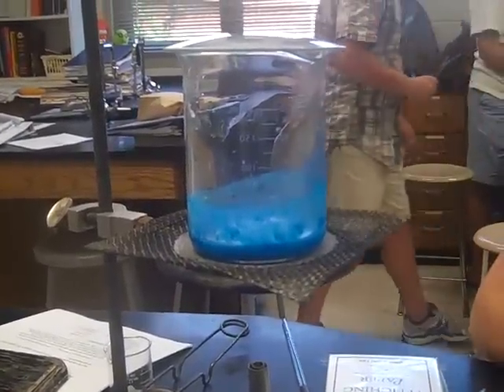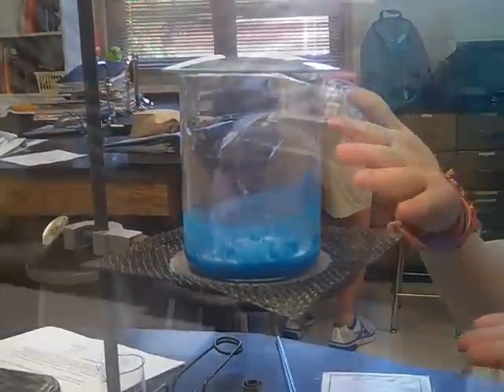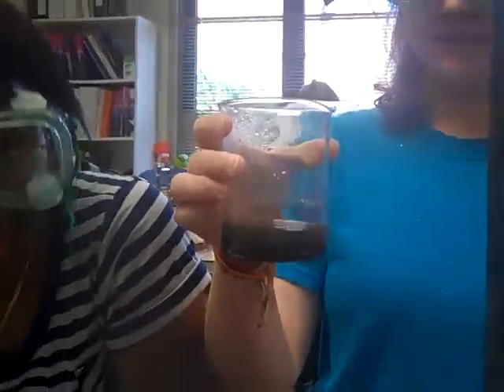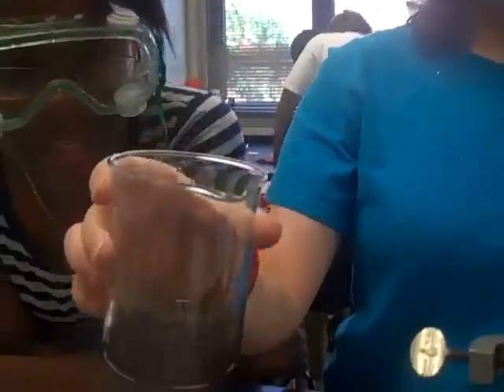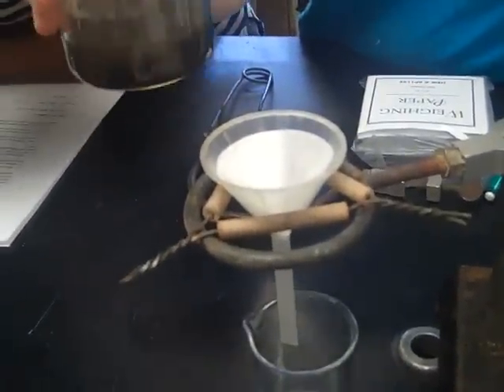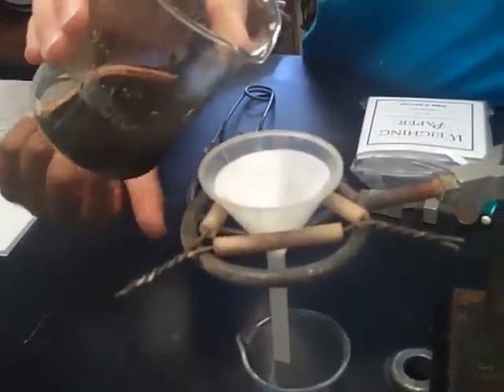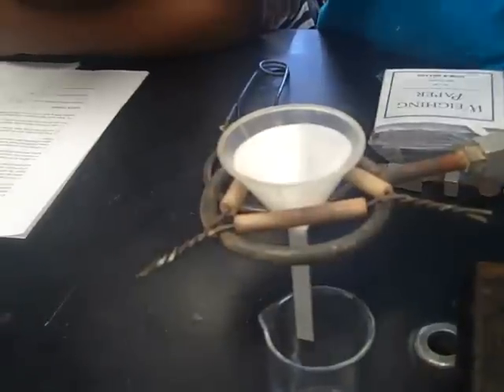We will notice this change by the solution turning black. After we heated our solution it completely decomposed into water and copper 2 oxide. We are now going to filter it to separate the water from the copper 2 oxide, which is the black precipitate at the bottom of the beaker.